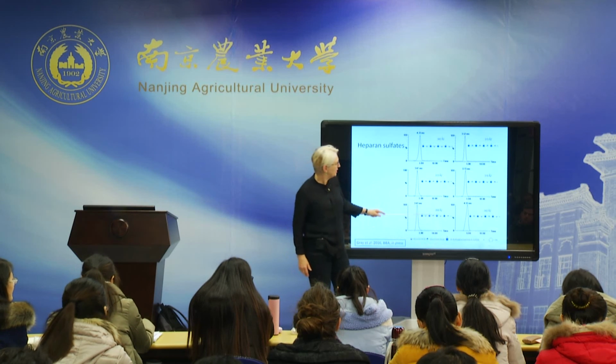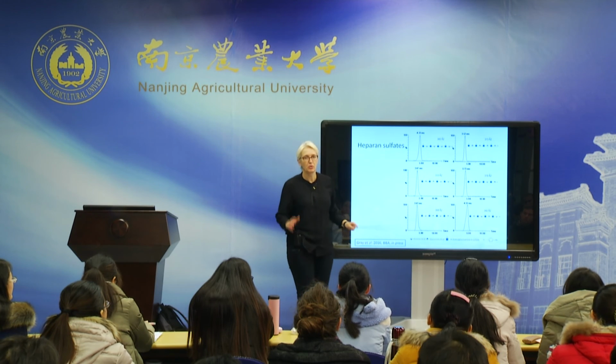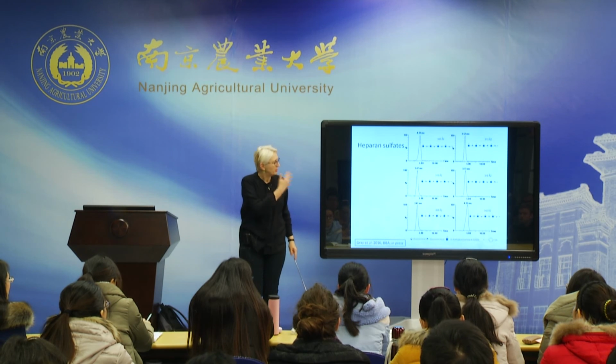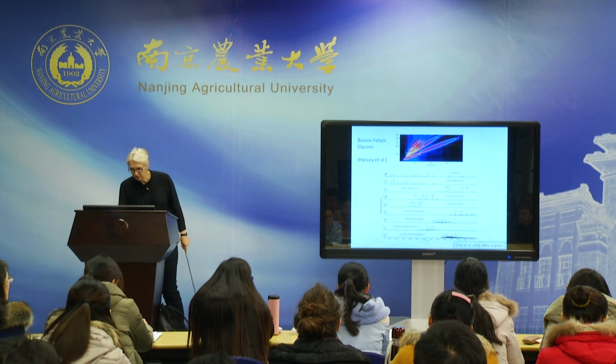This group had all the permutations, and we could actually distinguish them again with ion mobility. So again, somewhere biosynthesis doesn't really help you very much, standards don't really help you very much, but with ion mobility we can actually identify these and distinguish between them.